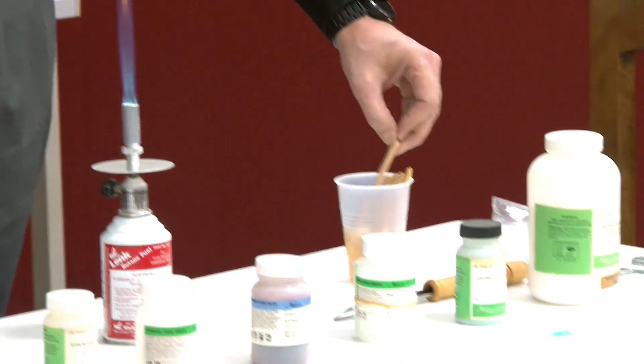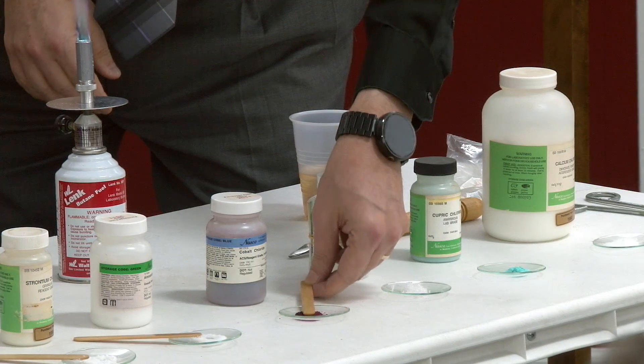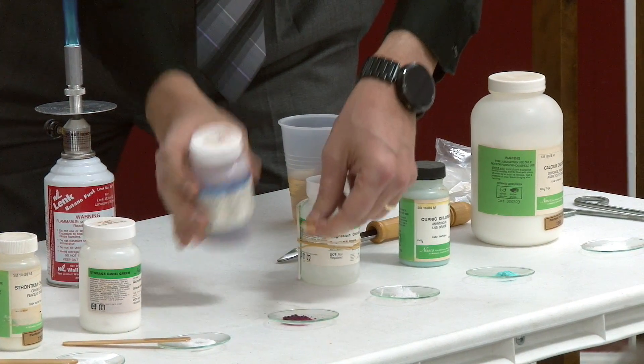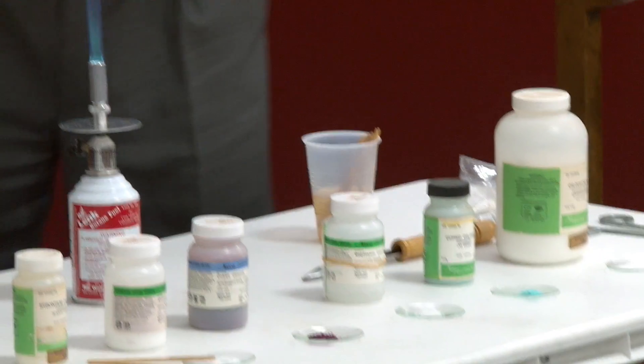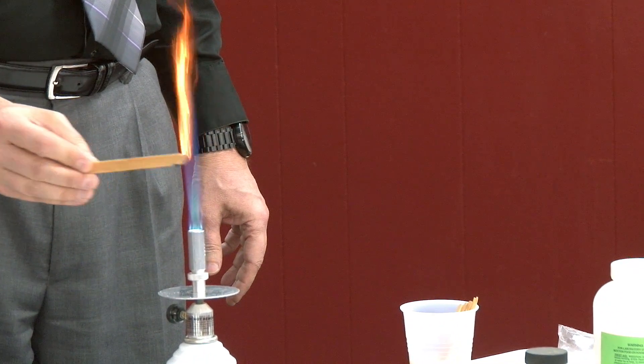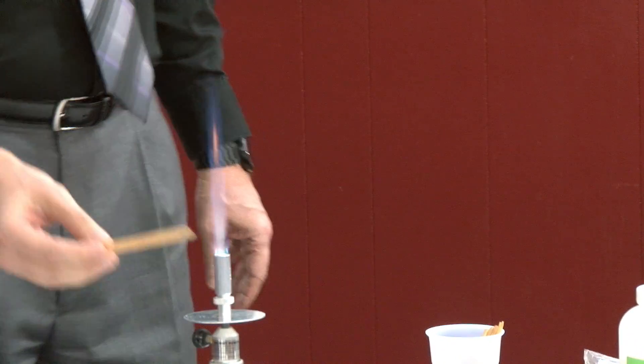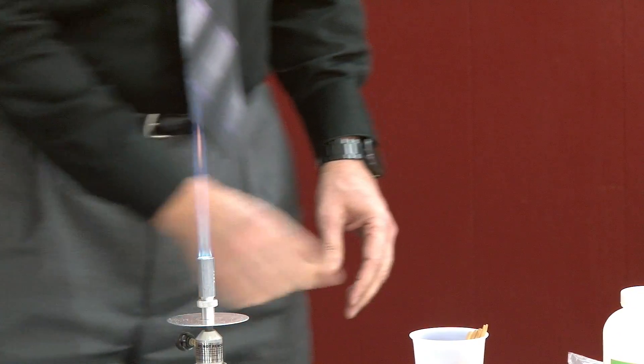I've got to remember to not lean right over the flame. What did I say this was? Cobalt. Oh, cobalt — it's white. Not what you expected, huh?